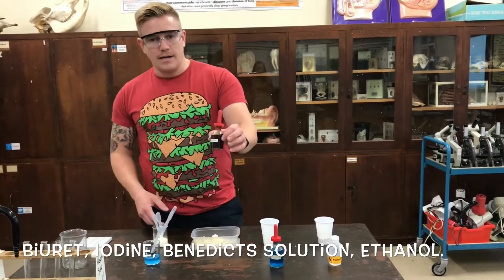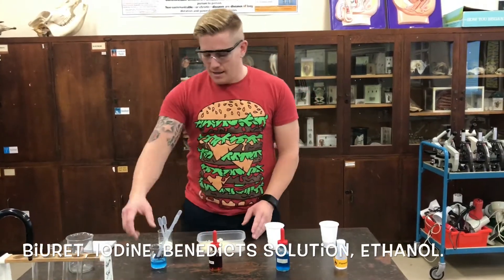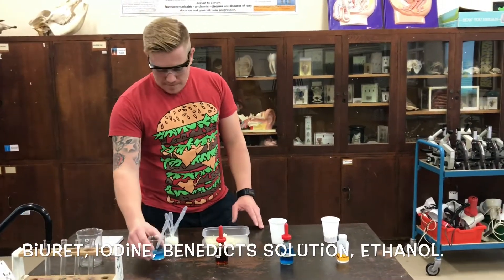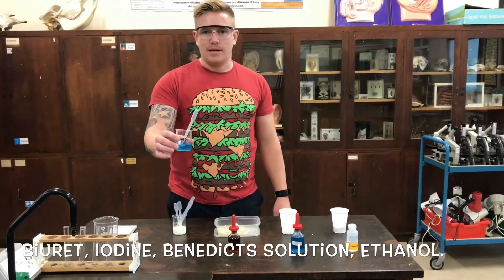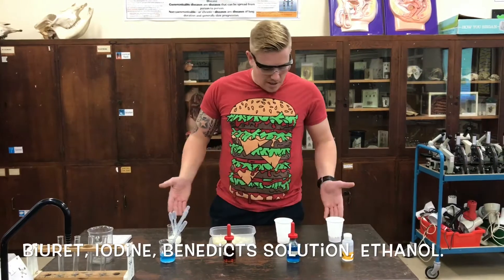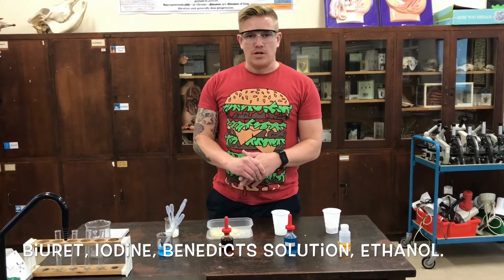We'll use iodine. We all know iodine tests for starch, and we'll find out if there's any starch — that will go black. And we'll use the biuret. The biuret will test for protein and it will go a purple colour if there is any protein present. So we're going to test these four foods using these four chemicals, and I'm going to show you how.